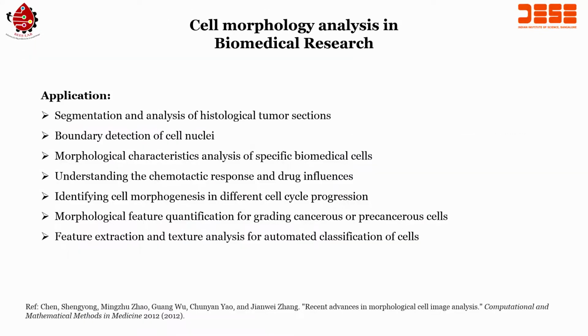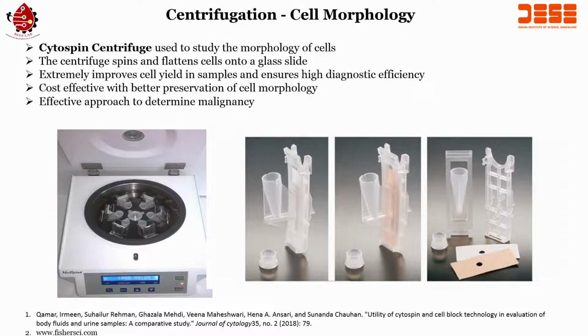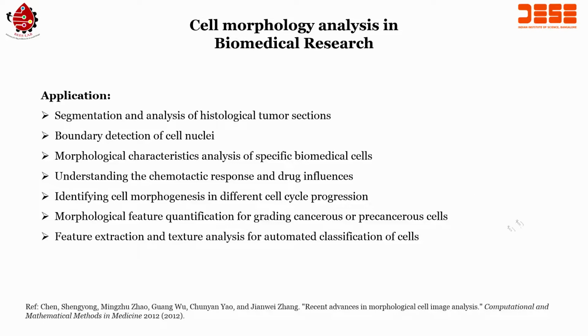So, now to understand this, let us see what we can do. Before we go to that, the way it is carried out, the current technique that we use to screen the patient, let us first understand a technique called cytospin. Alright. Before cytospin, let me draw a slide so you understand why we have to go for cytospin. Now generally the cells are taken from the mouth with the help of a cytology brush.